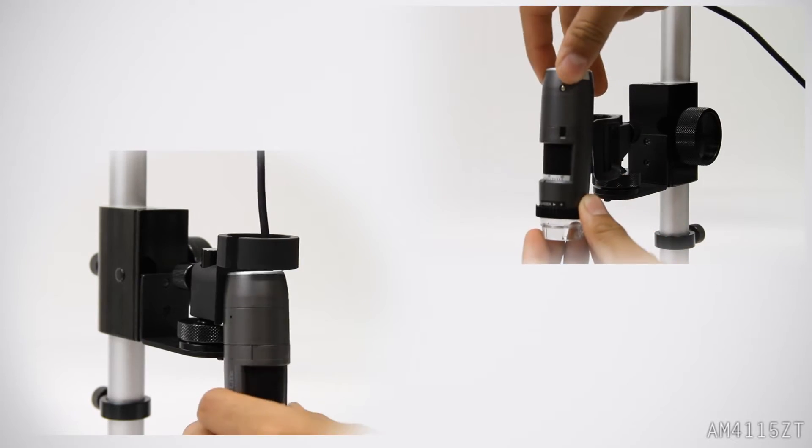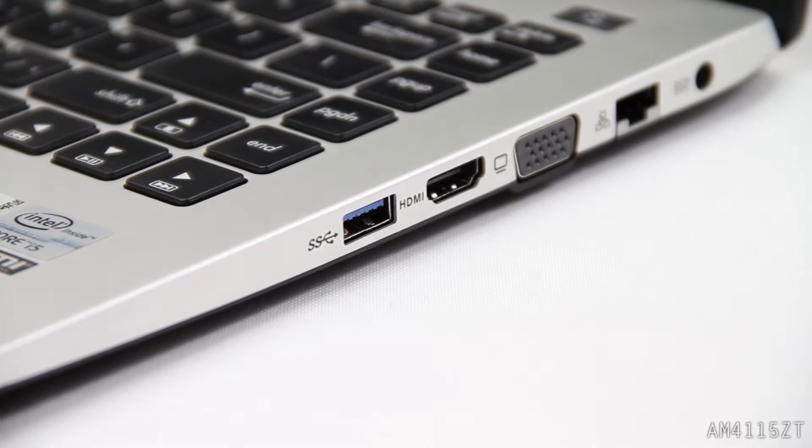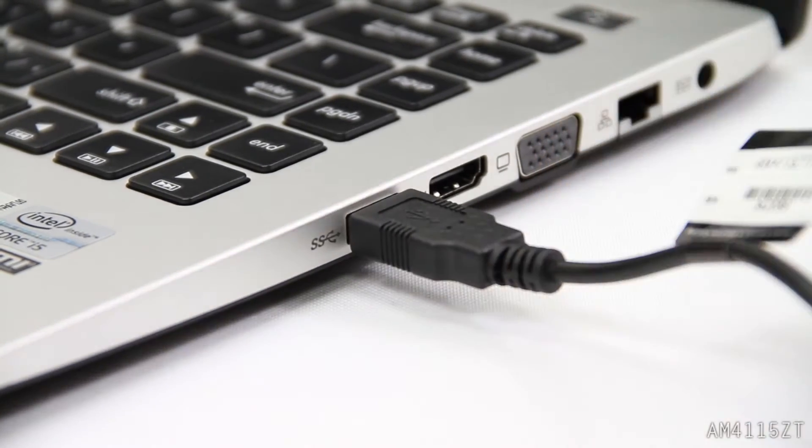To use the AM4-115ZT, place it into the holster. Once you install Dynocatcher 2.0, connect it via USB port.